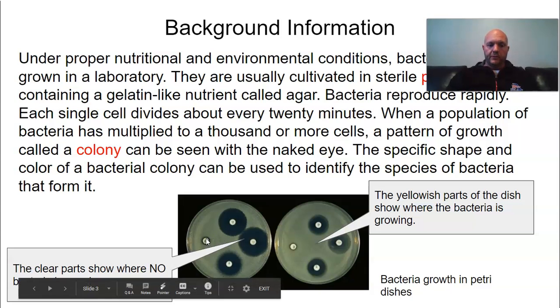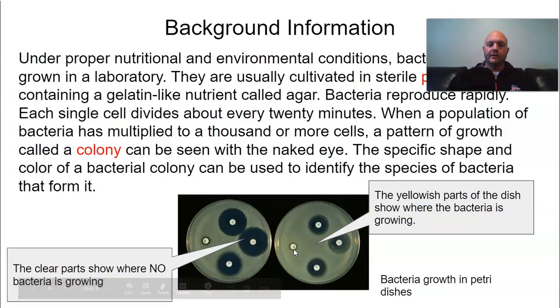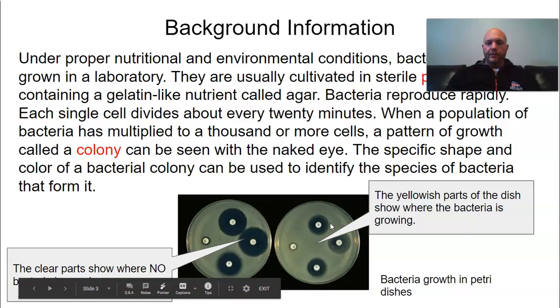This one is probably just paper, because you need something showing that it is not the disc that's killing them. It's what's on the disc that is killing them. That's probably important. It's the control, and then that's pretty much it.